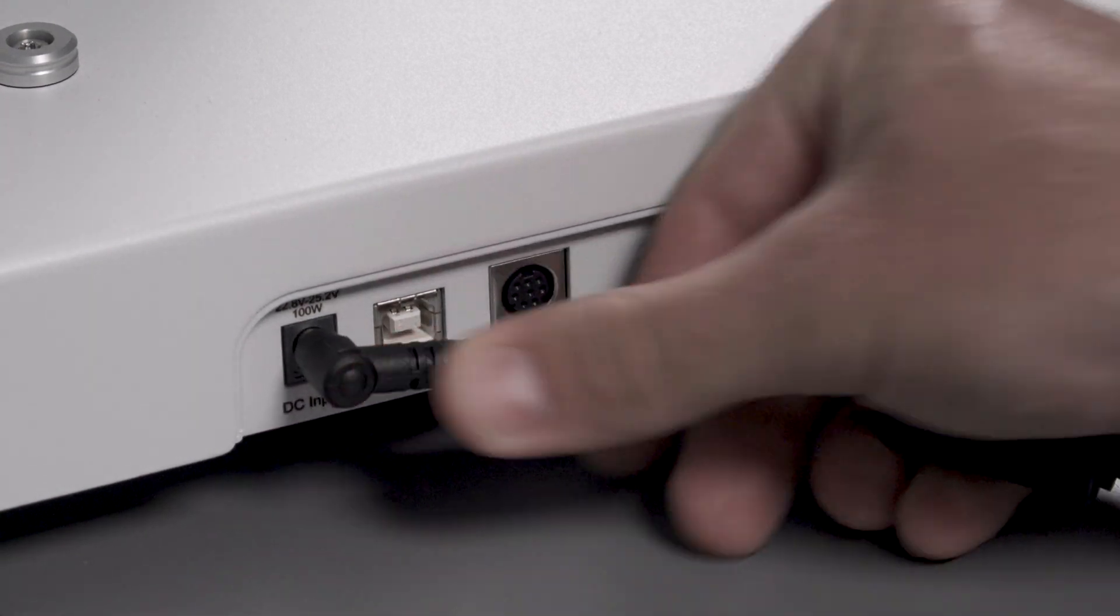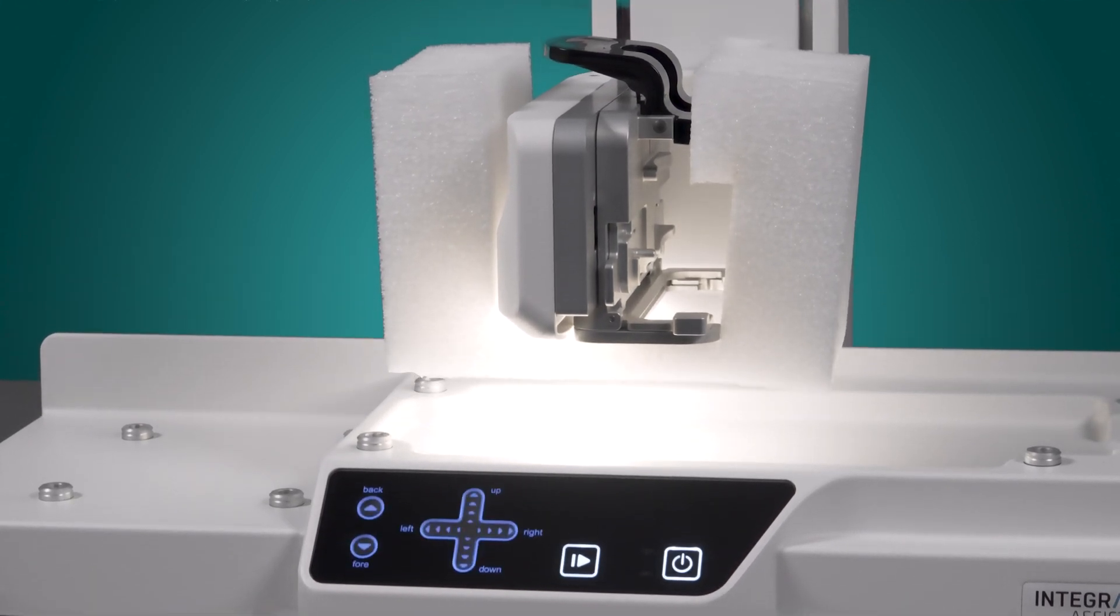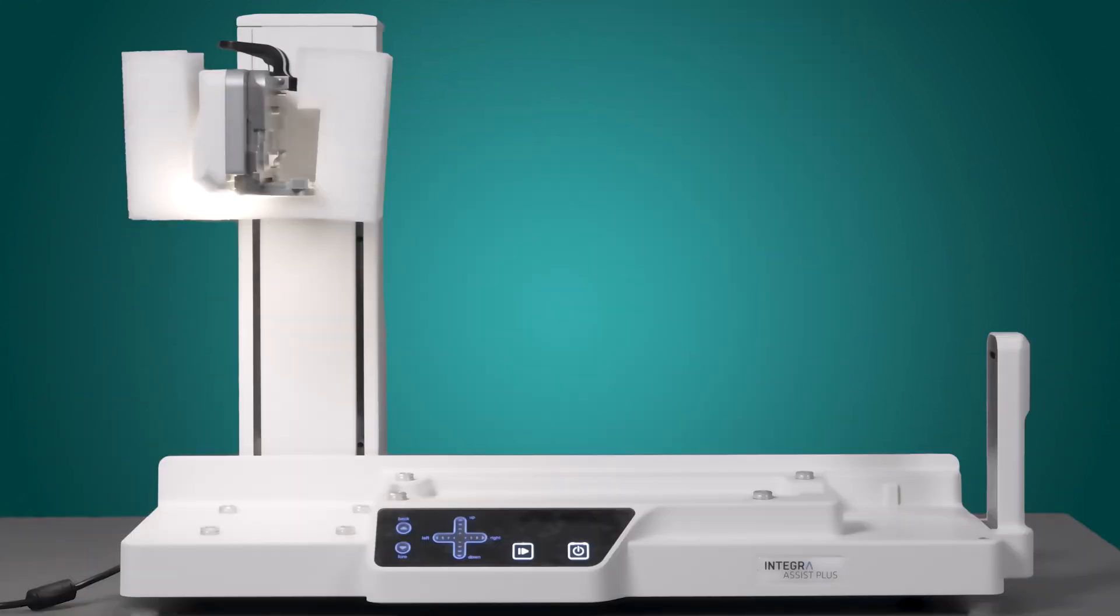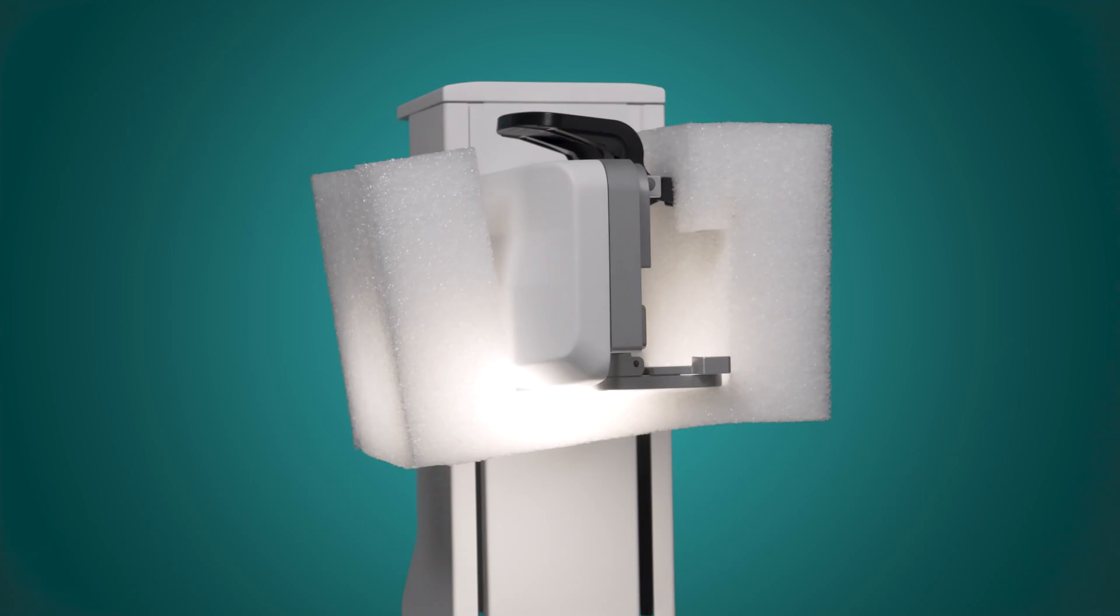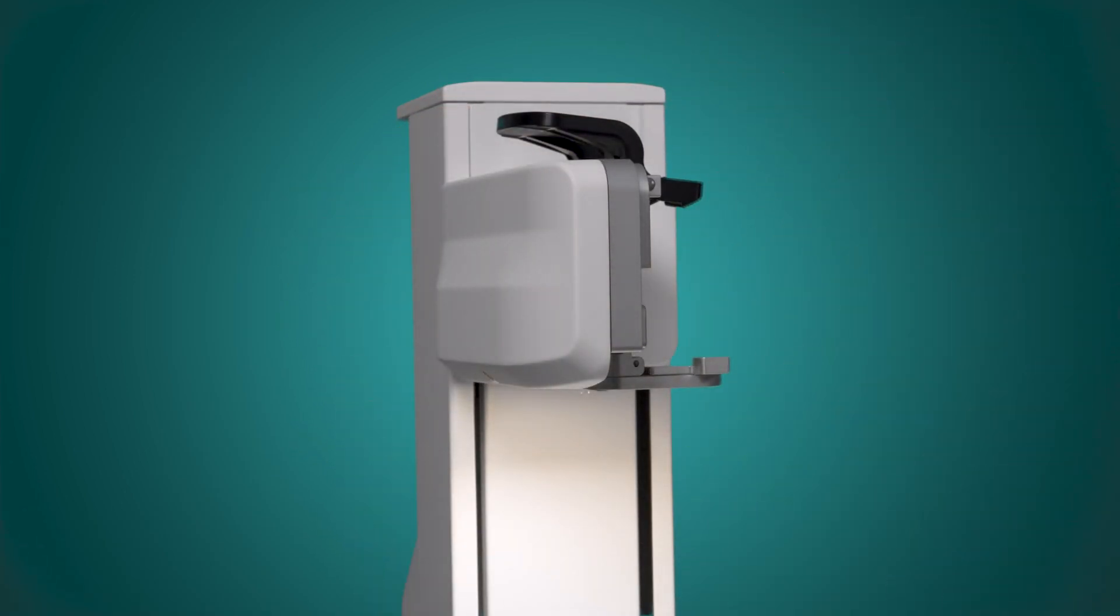Connect the power supply on the side of the instrument, switch on the device, and start the homing process. After the device is homed, remove the protection foam and the Assist Plus is ready to start.